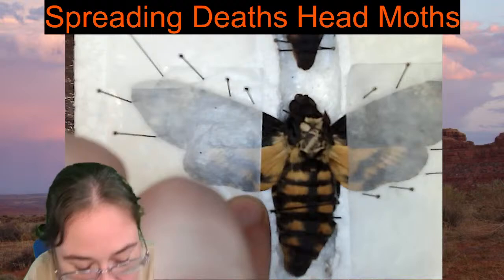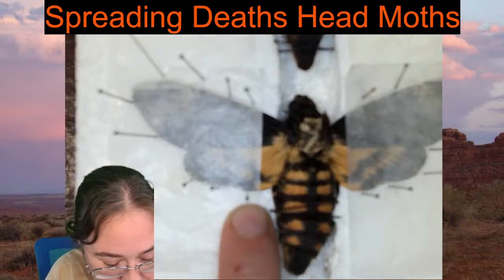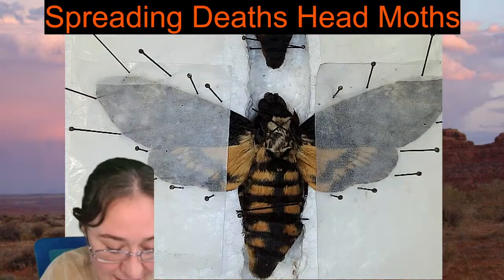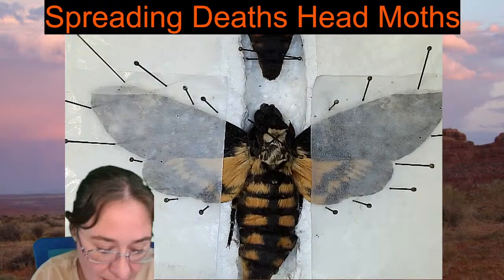All right. So, we've got both of these hind wings spread. It is 1959. So, we have about 60 seconds left to finish this guy, and I think it should be pretty easy. I want to align this abdomen to make sure that it is going to be straight. You can see it's kind of curving off to the side a little bit, and I want to fix that. So I'm going to be taking these two that are crossing over the abdomen. I see this leg here on the side, and a lot of times when I see the legs here on the side, I want to take them and put them into the channel.